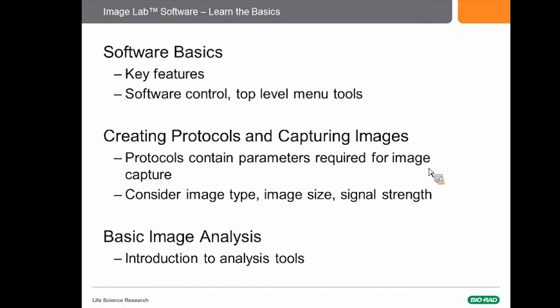First, we will go over software basics. We will cover key features that are available in this software. We will cover software controls and review important functions in the toolbars and menus. Next, we will demonstrate the creation of a protocol and capturing images with that protocol.